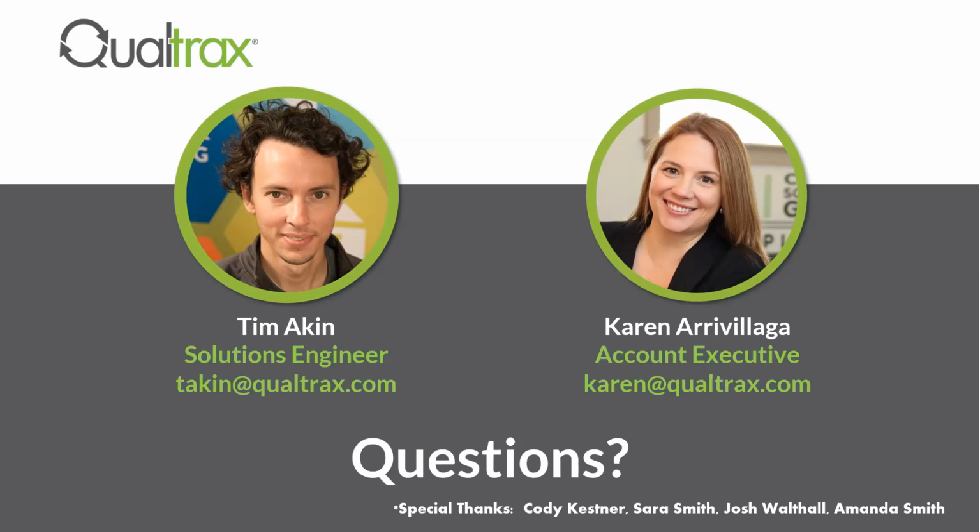The majority of people start with their quality processes. I think that's, being an eQMS, you want to get things like your CARs and your non-conformance and all of that kind of stuff in. So that's where we always see the focus start. But really anything that is in a form today or a process that you do today can be a workflow.